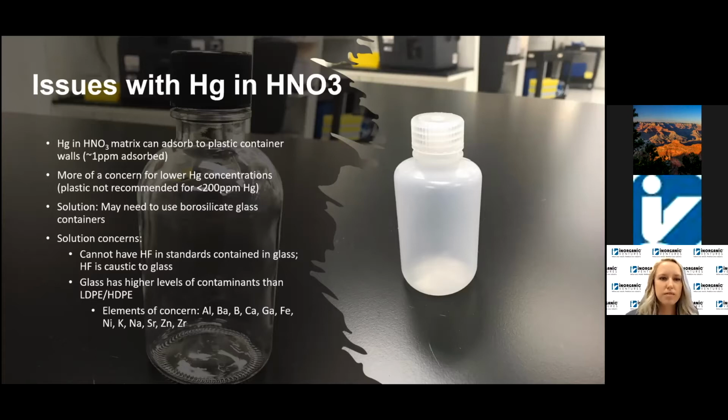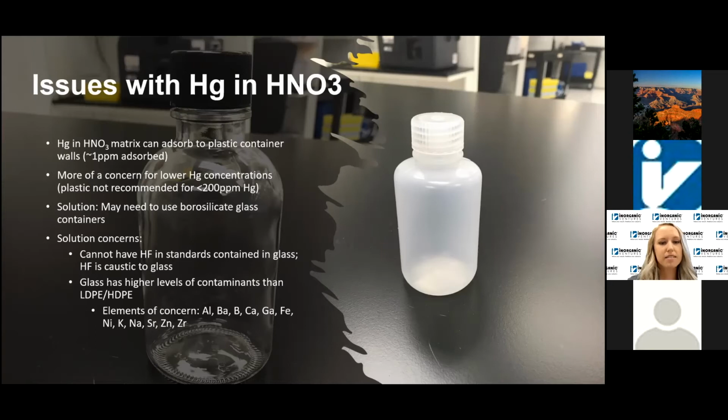So an alternative you can use is borosilicate glass containers. But again, there are going to be concerns for glass because glass is going to have higher levels of contaminants. We've done leaching studies and found that the elements listed at the bottom of the screen here are going to be the contamination issues you're going to want to look at. So if these analytes are in your samples or standards, glass may not be an option depending on how low of a concentration you're looking at.